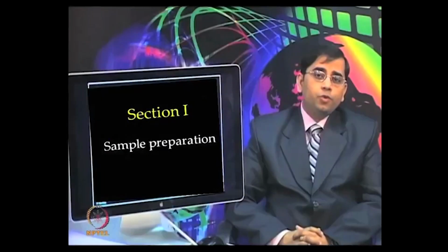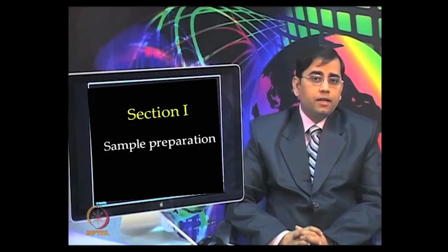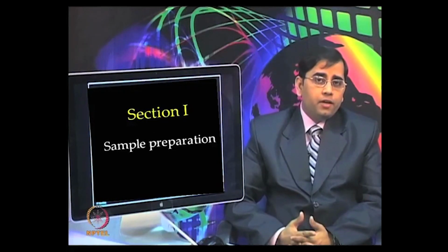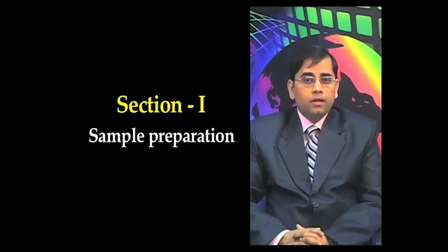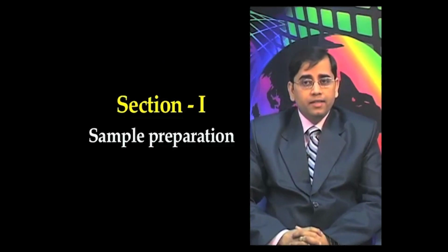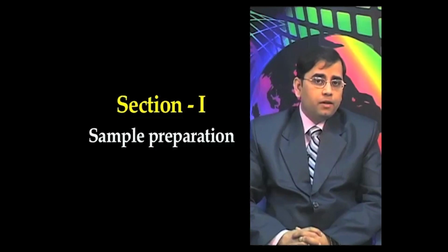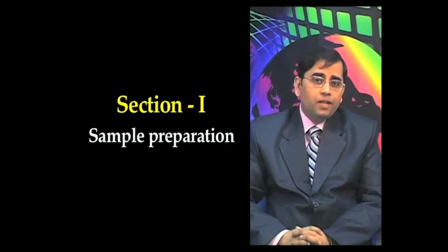The in-gel digestion of proteins isolated by gel electrophoresis remains a core area in mass spectrometry or in any of the proteomics applications. So, the following video which we are going to watch is going to provide the broad guideline for the in-gel digestion. However, the recipe is very flexible and it varies from lab to lab to meet the specific requirements of a particular proteomic experiment.